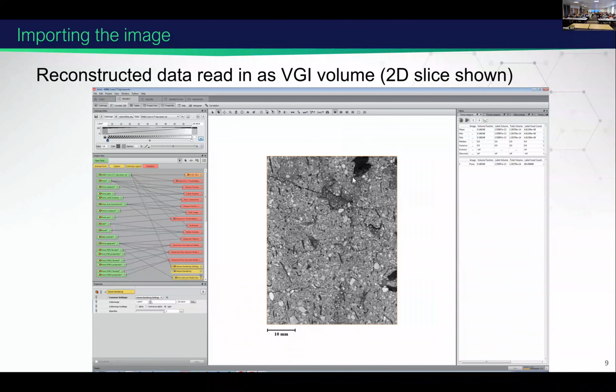This is one of the MONet data sets I'm showing here. This is one single slice. Here we can clearly see the different phases present in the soil. This is because, as Thomas said, we did a high resolution scan. Because of that, we can clearly see these various phases, and we can identify the micro pores as well. Here the pores are black, and the white particles are high density material or some minerals present in the soil core.